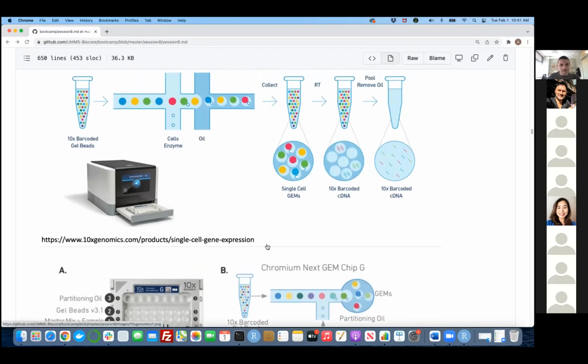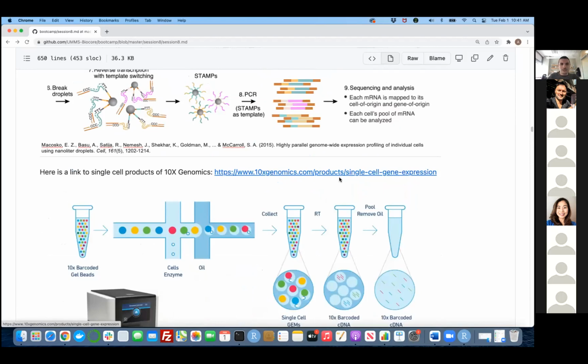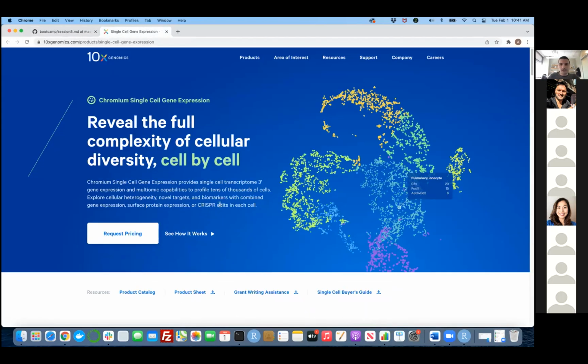And the RNA is isolated where the UMIs and the barcodes are attached to unique RNAs. I must say, it works like magic. You just push it and wait for 20 minutes, go get a coffee, and it will do everything for you. And once you come back, you can move on with the library prep as instructed in the 10x Genomics instructions. So you can go and take a look at these products of the company.